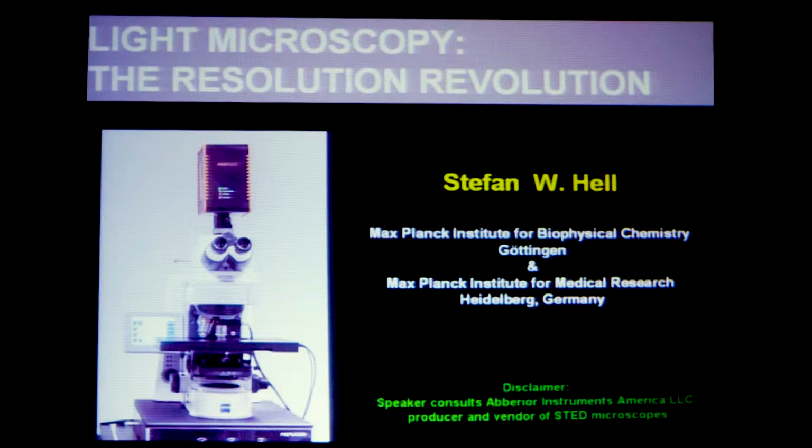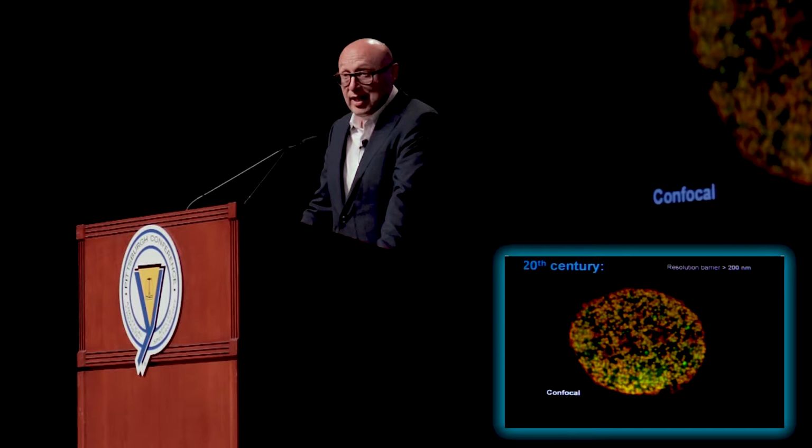As you certainly know, throughout the 20th century, the resolution of any light-focusing microscope and also fluorescence microscopy was fundamentally limited by diffraction to about 200 nanometers. And the best picture that one could get with focused visible light in biological imaging was by confocal microscopy. But confocal microscopy was also diffraction limited.